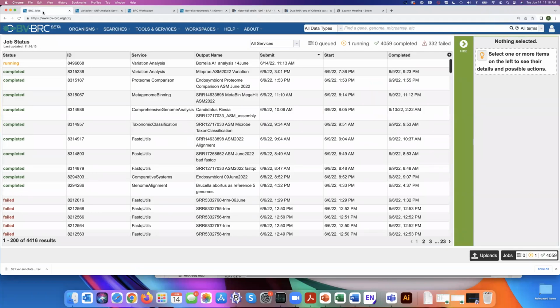So it's basically going to use the metadata, and obviously the assumption is that the metadata is correct. But if it's incorrect, then you might get a failure in the run. I've been up to my eyeballs in SRA data lately, just for this and for other examples, and I'm often astounded by the lack of care when people are submitting their data. So that's an important point to everybody. If you submit data to SRA, make sure you're careful with labeling the metadata appropriately. Anyway, sorry to interrupt, Rebecca.